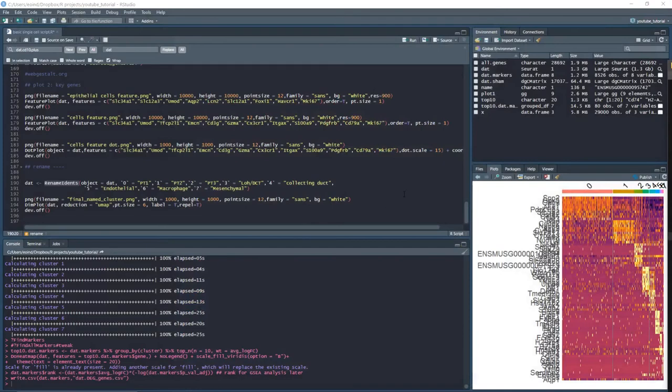And honestly, the hardest part of all of this is probably classifying the cells at the end. It definitely helps to have some sort of biological insight into what's going on and familiarity with the tissue, or being friends with someone who knows that. A pen and paper is sometimes quite useful as you just start iterating through the process, trying to account for all the cells you would expect to be there.